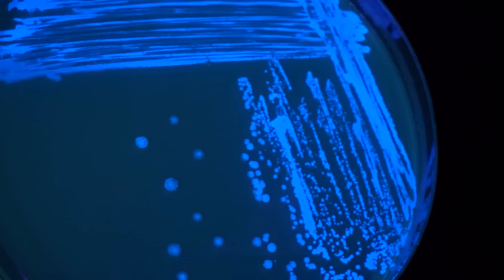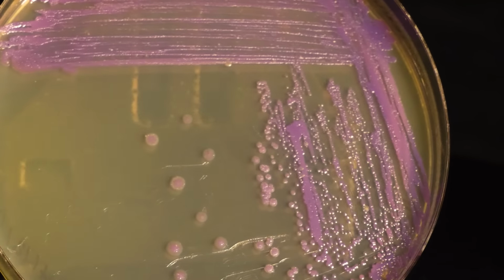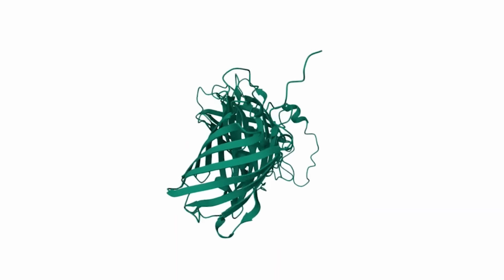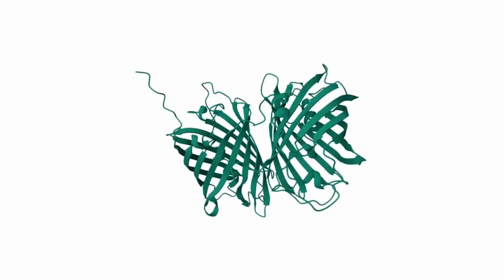Sure enough, it works exactly as designed, and sometimes designing proteins is literally this easy. You just find the bits of other proteins that do the thing you want, and you slap them together with a linker and express them as a fusion. Moving beyond electric blue, there is a whole collection of other weird fluorescent proteins.